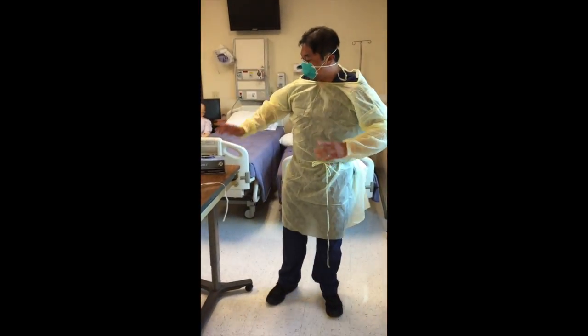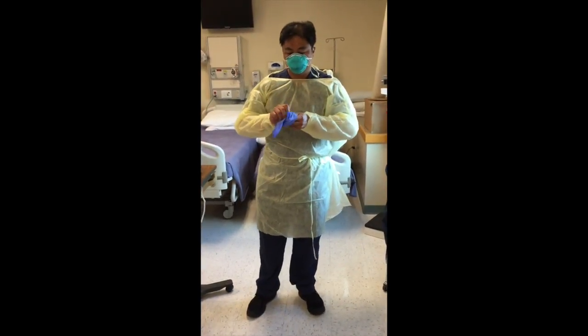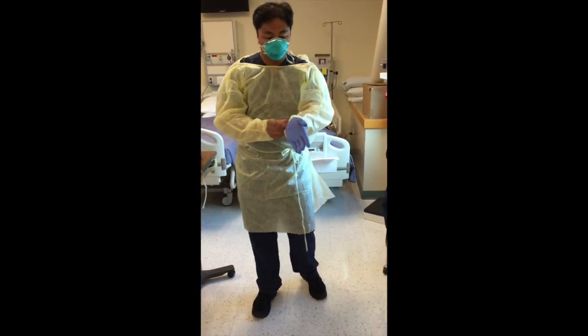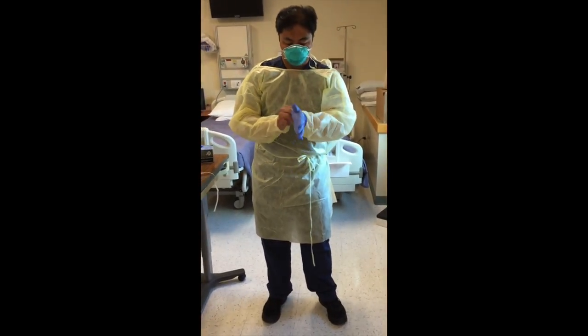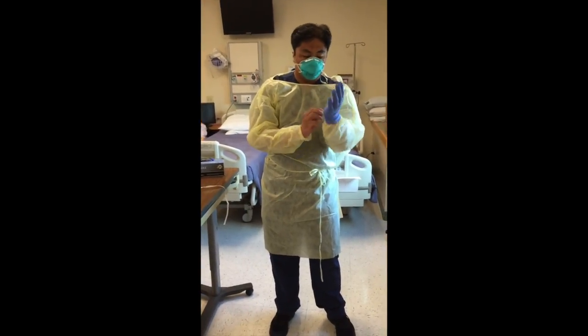Once you have your gown on, you can go and put on your gloves. When you put the gloves on, you want to make sure that you put them on over the cuff of your gown. That way you don't get contaminated here.